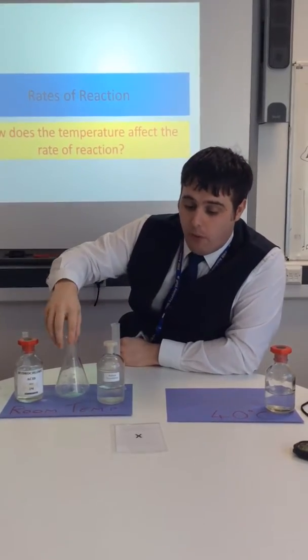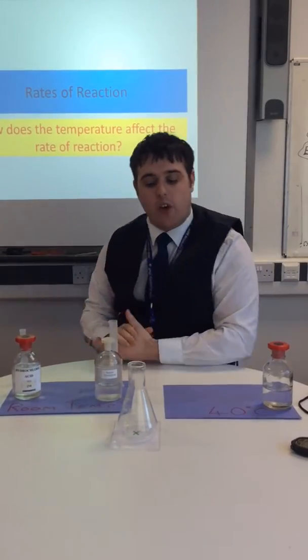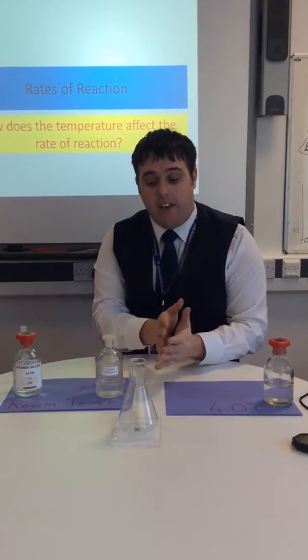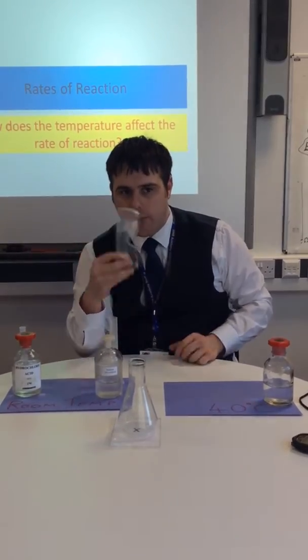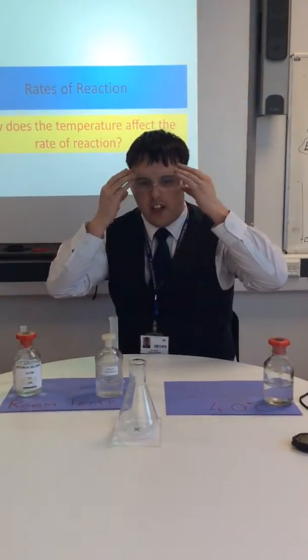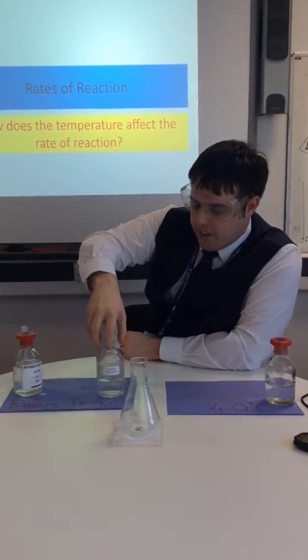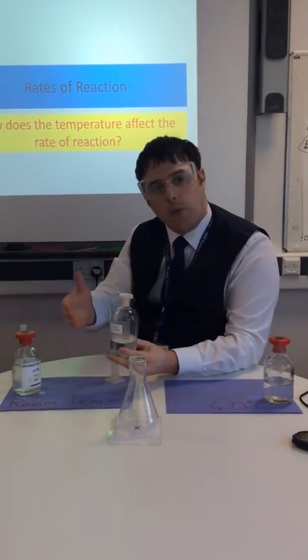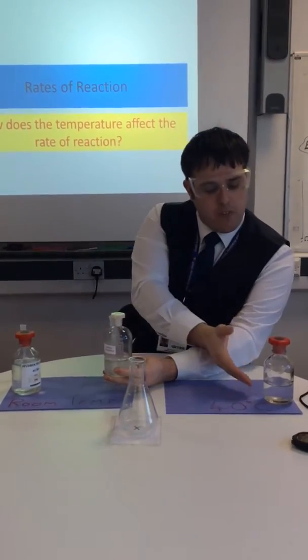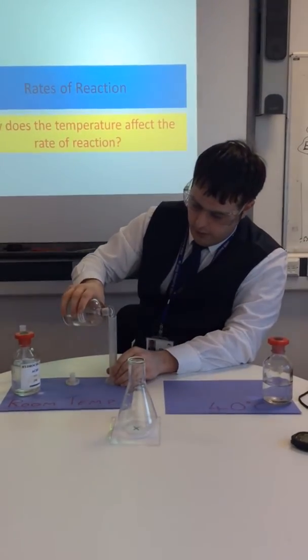To begin with, I'm going to place my conical flask on top of the X there, just preparing ourselves. I'm also going to consider my safety — it's time to glasses up. First thing to go in there is 25 ml of sodium thiosulfate. I'm going to work with room temperature first, then I'm going to move to my hotter thiosulfate. So, 25 ml, in we go.